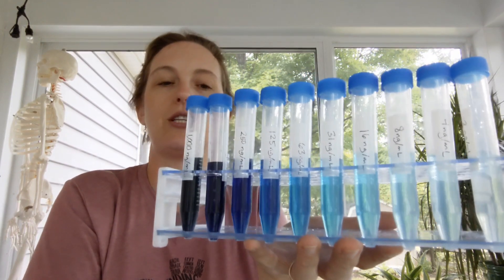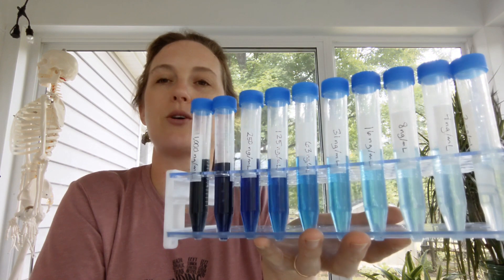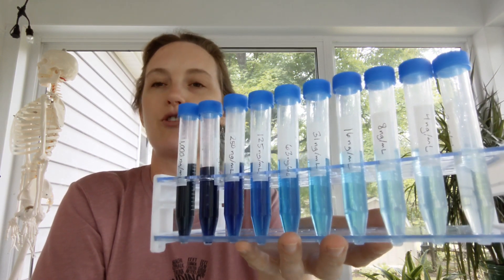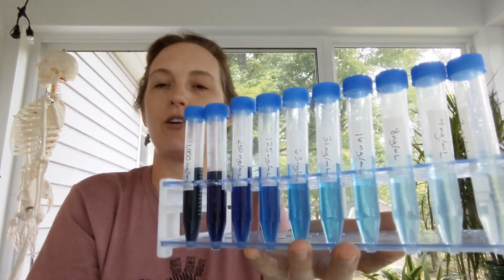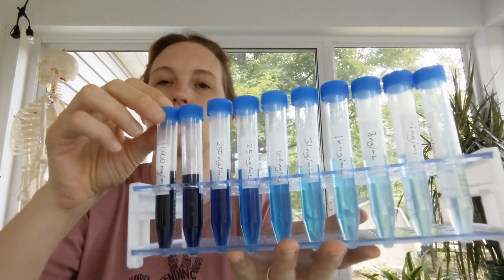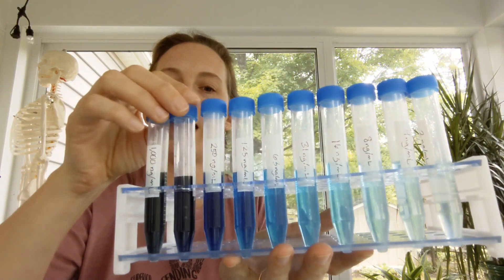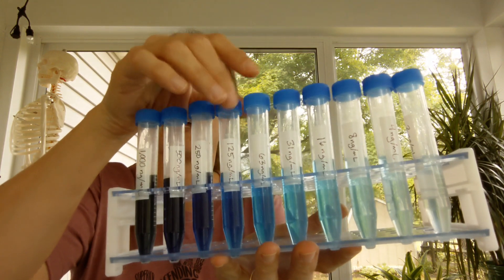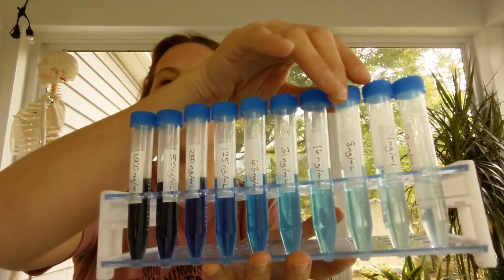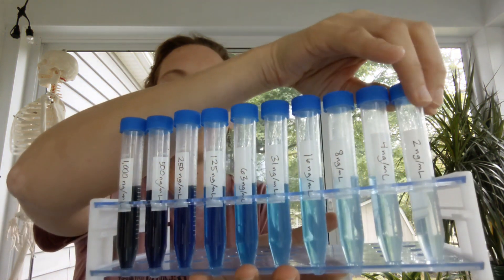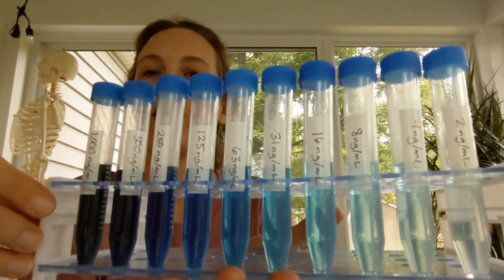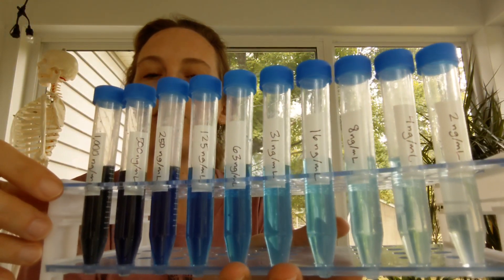You start by making a serial dilution, and this is so that you have controls with known concentrations that you can use to compare your unknowns to. And you start with the most concentrated, and then you usually dilute 50% each time. So you can see the number values going down on my tubes, and you can see the color concentration decreasing.